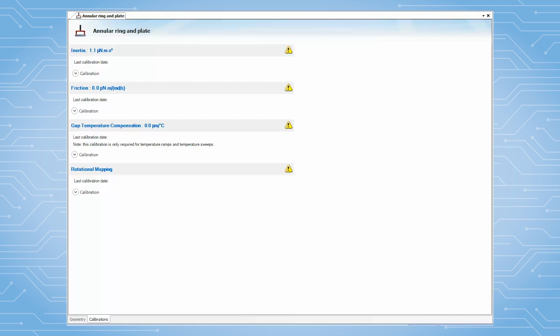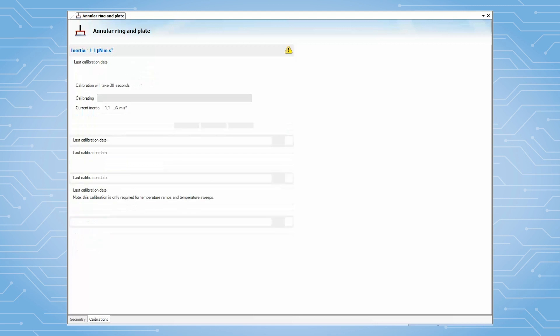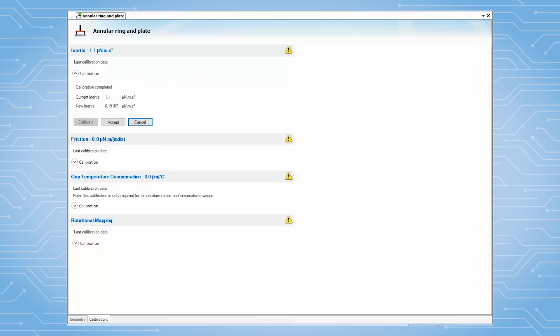Under Inertia Calibration, click on Calibrate to begin. This calibration takes about 30 seconds. After it is finished, click on Accept.